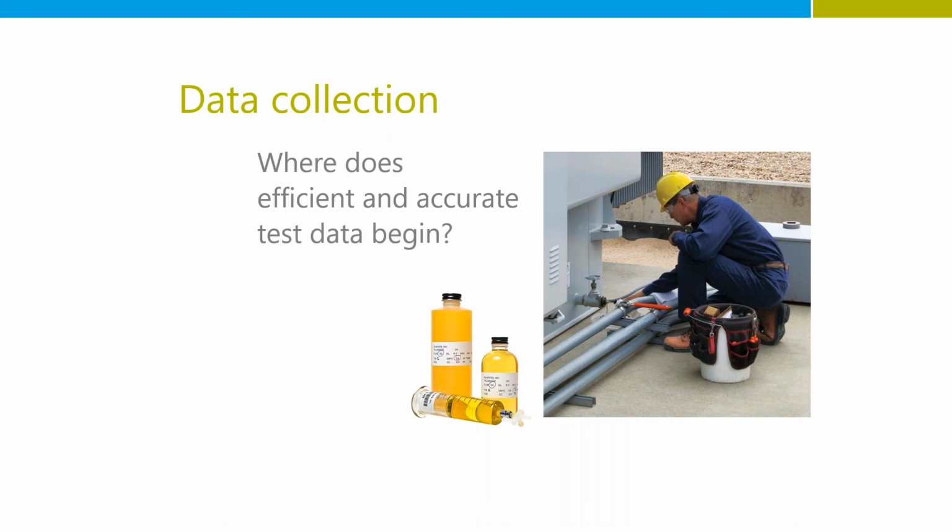Yeah, so we're talking about, of course, container identification, and if we're using barcodes or RFID tags or whatever that technique would be. And then we're also talking about handling those exceptions, such as tracing things through the mail, as well as lost and broken containers and the other things. How do we handle those so that we can communicate this information back to the customers? And then just all the integrations that can happen in that, we're talking about order changes, order processing. It can be quite complex depending on really what the customer's needs are, and really that's where it's at. Where we're trying to say, what can we do to provide the best data to our customers accurately, and really using those systems to give us a competitive advantage.